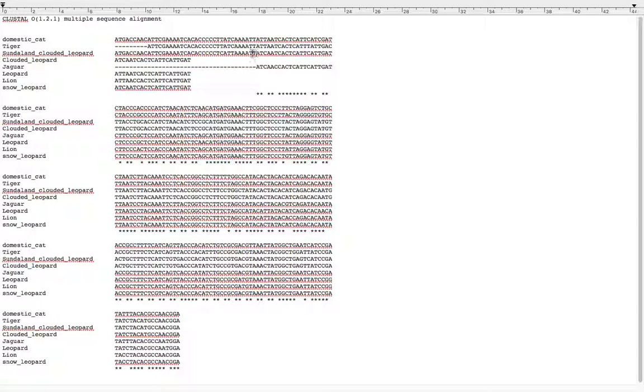And I know it might seem a little bit strange to be getting rid of sequence that is of perfectly good quality, so ones without the gaps, but they have to all be equal.